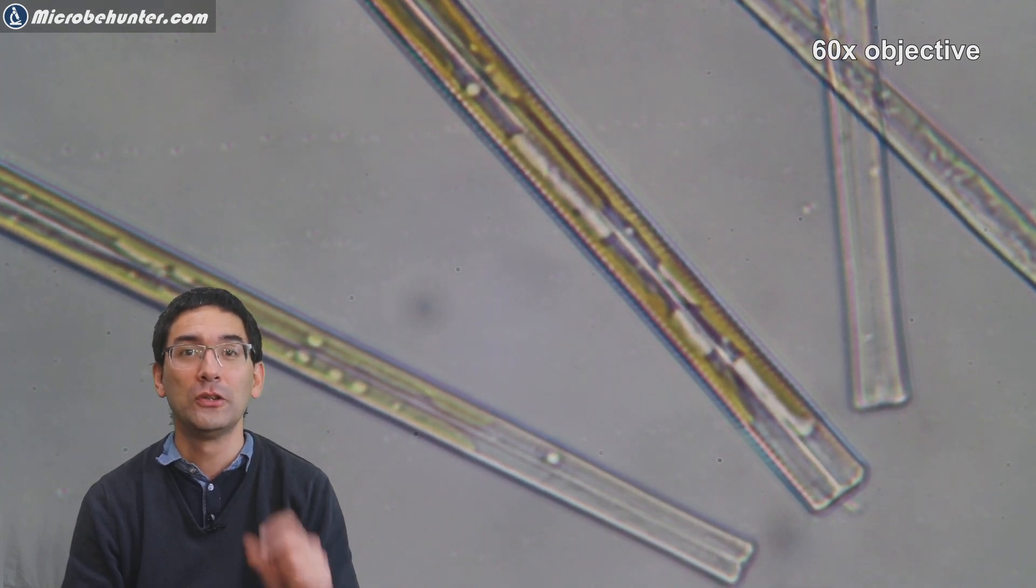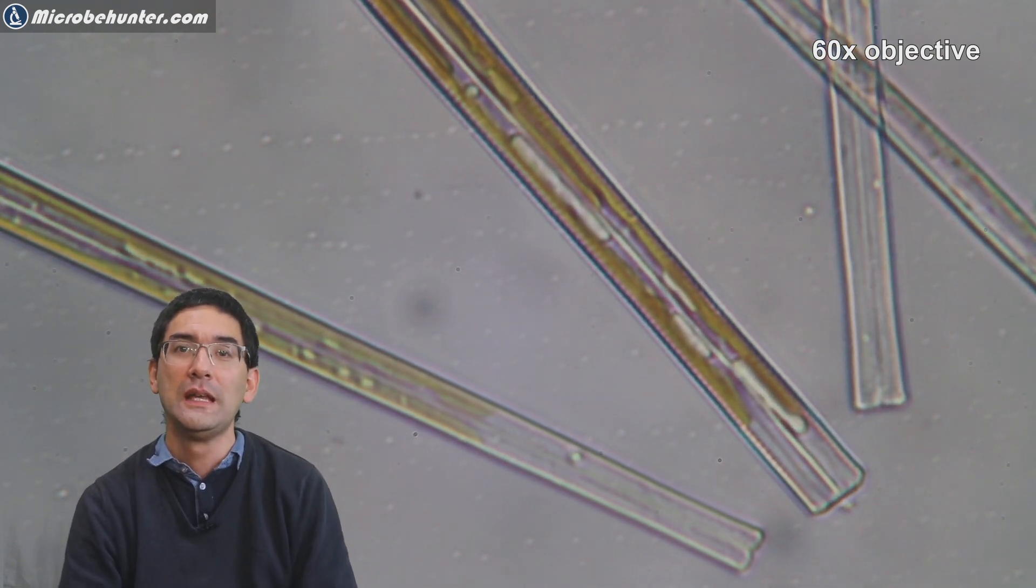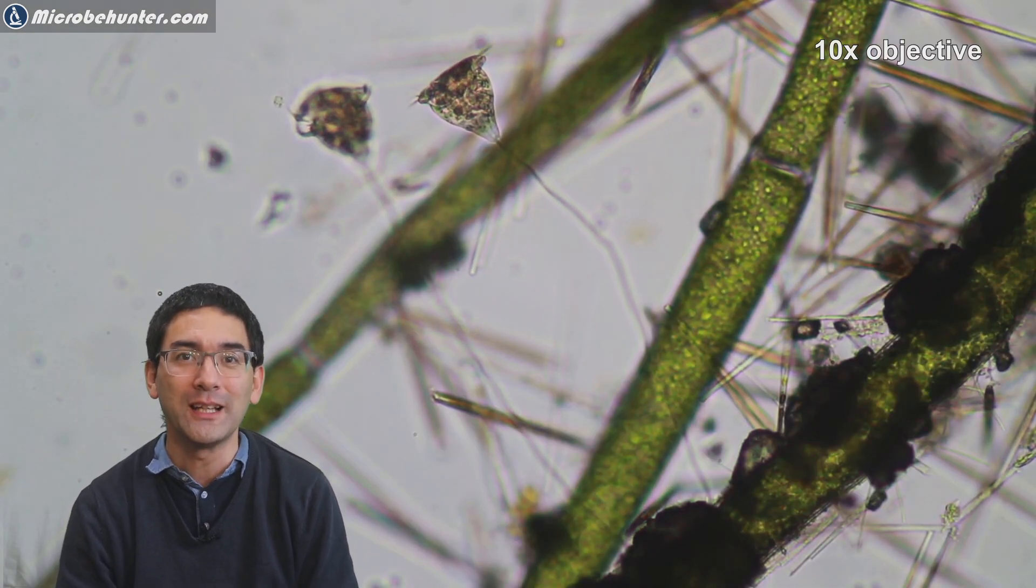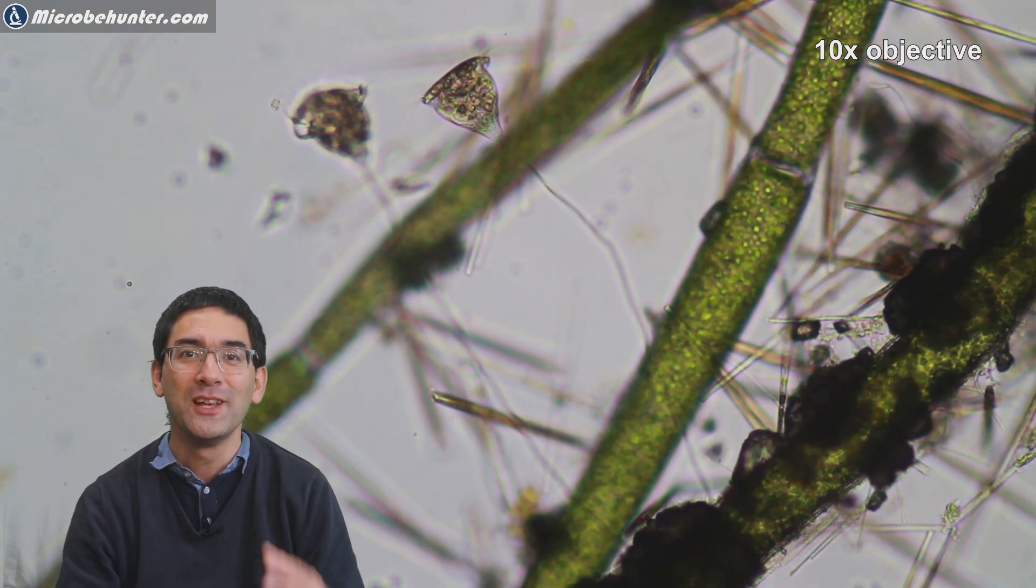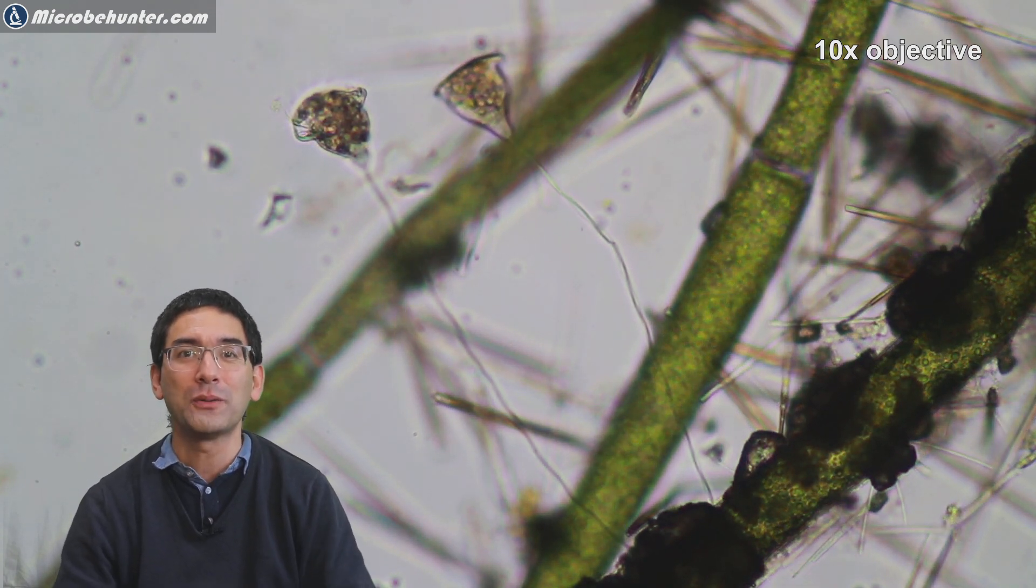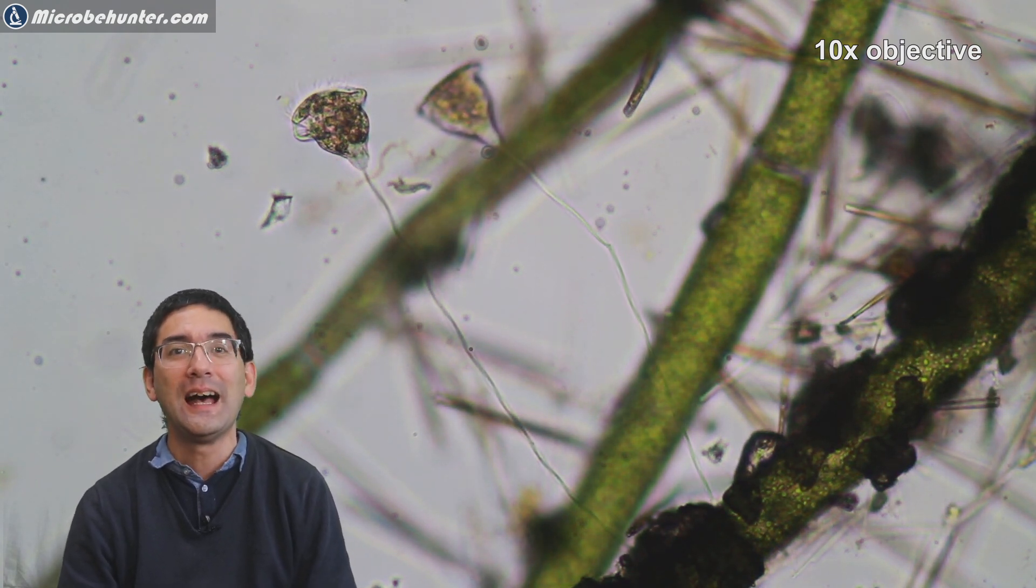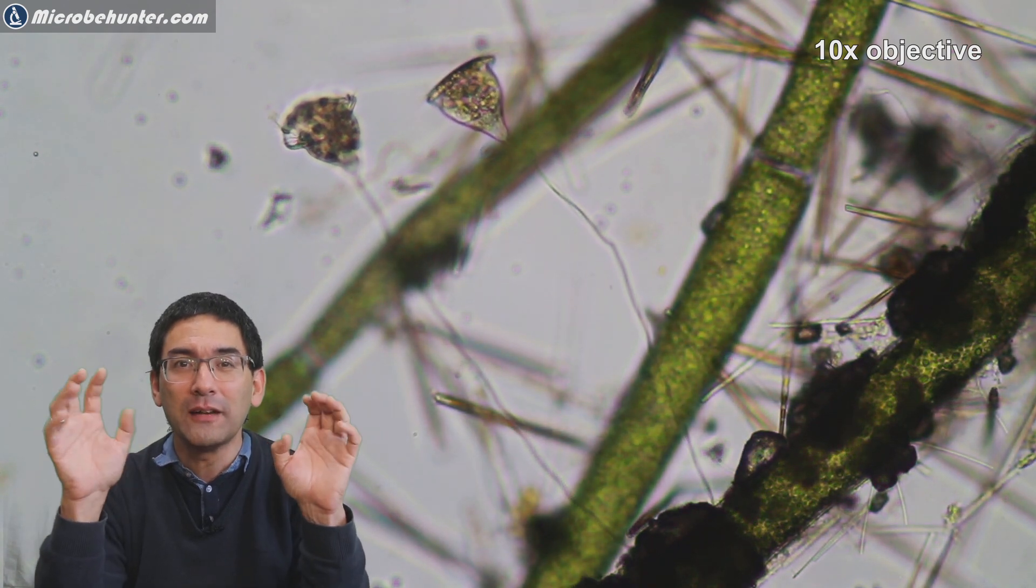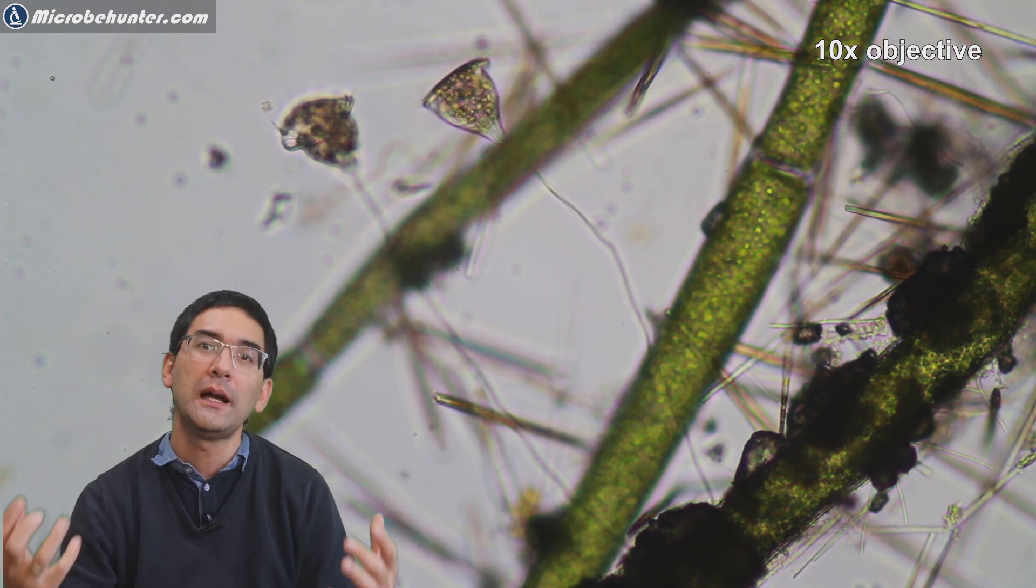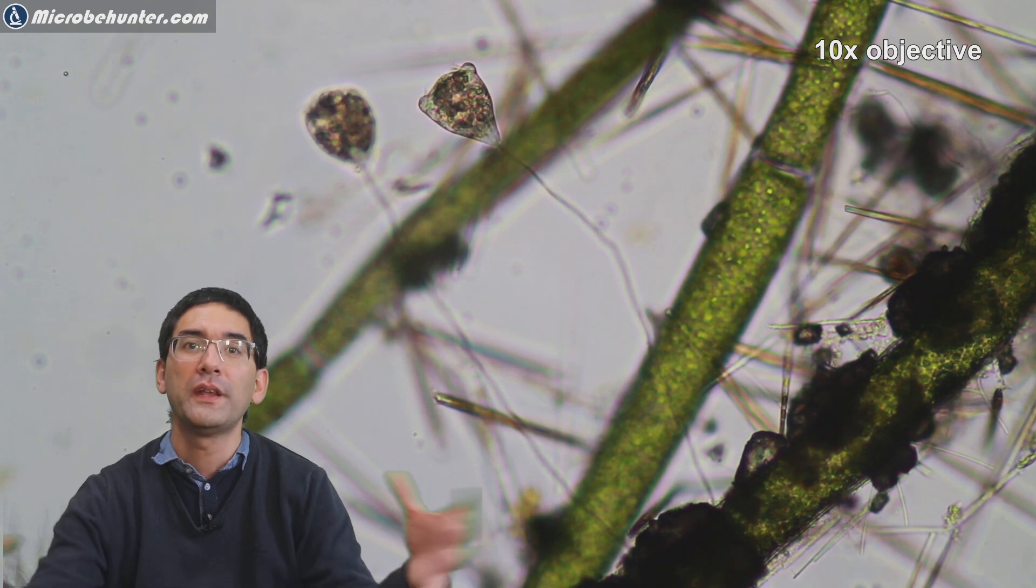Look carefully into those diatoms. You can actually see that there are cell organelles moving around. I was lucky enough to also find so-called vorticella. These are stalked ciliates, two of them. Look what they're doing. You might already guess they can retract very rapidly when they touch something, and then they extend again. On the head part they have little tiny hairs called the cilia, and with that they're moving the water and suspended particles that you can find in them, bacteria and other debris. They are then sucked in and digested by the vorticella.